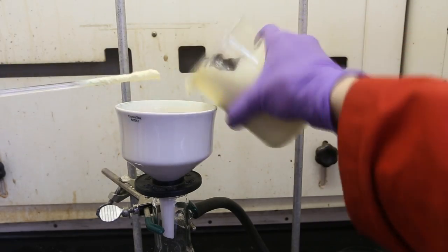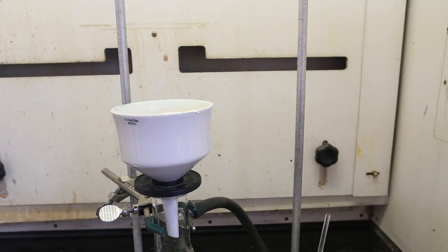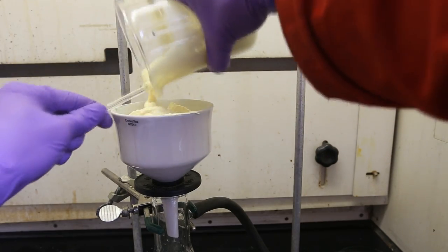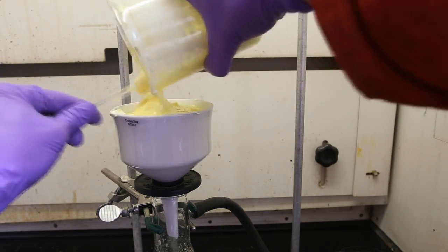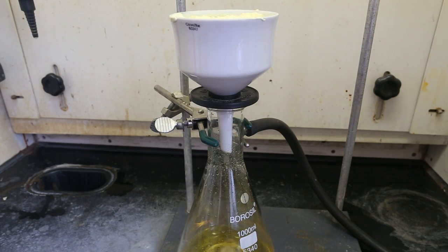Next, you need to filter off all of the liquid. You'll probably notice that it looks like the amount of product we have is significantly higher than the amount of acetanilide we started with. When wet with water, the product seems to significantly increase in volume. Wash your beaker several times with cold water to rinse out as much product as possible.